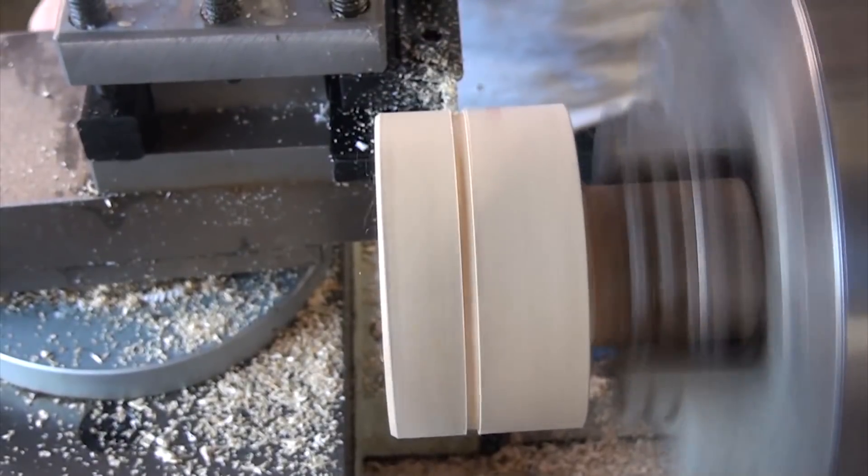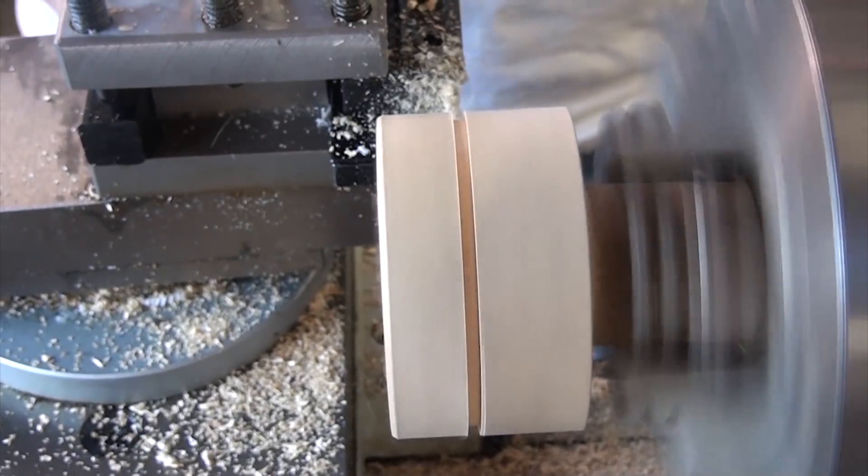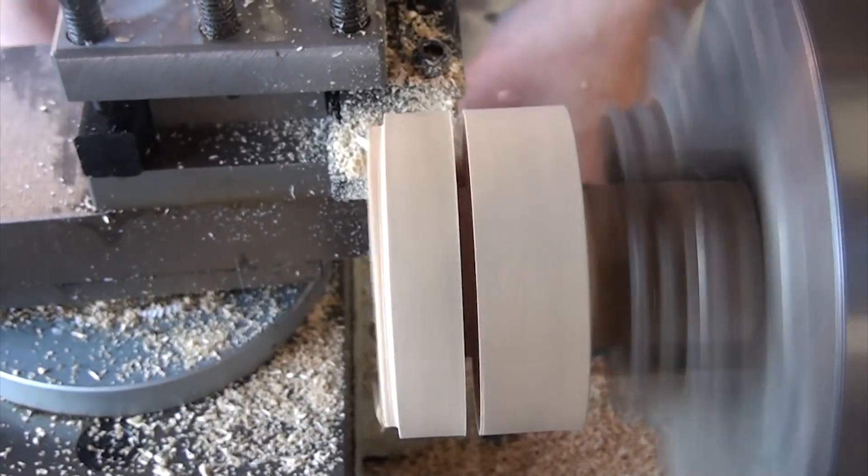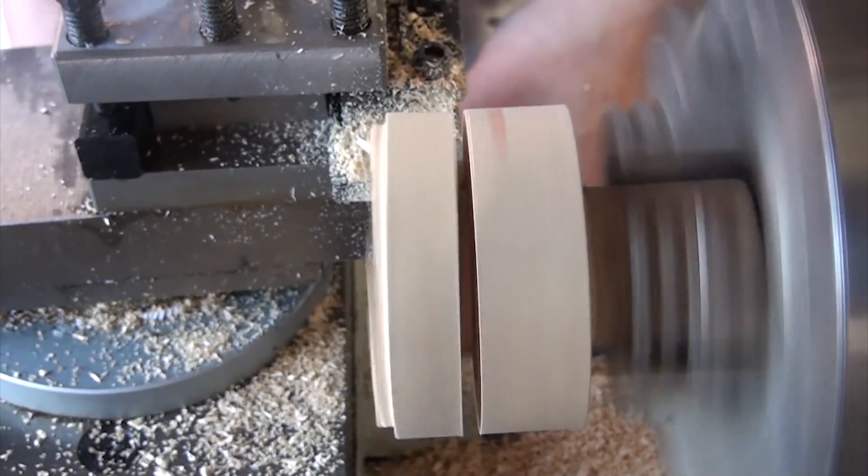Then I widened the inner diameter to fit the coupling, and then used the cutoff tool to part off the disc of material that I needed. After some brief sanding, I gave the disc a quick paint job to make it look better, but that meant I couldn't handle it for a while, so while that dried, I started working on the frame to mount this all in.